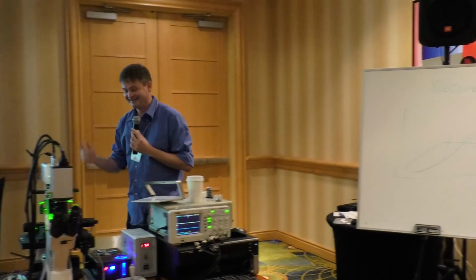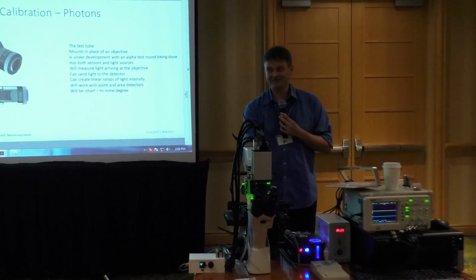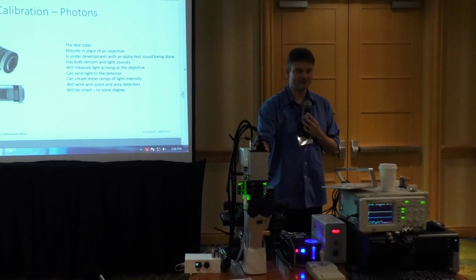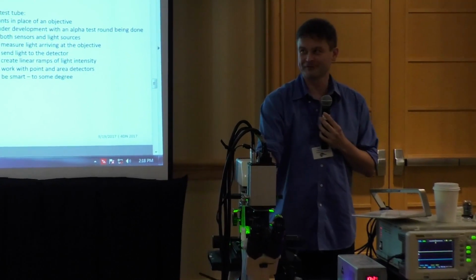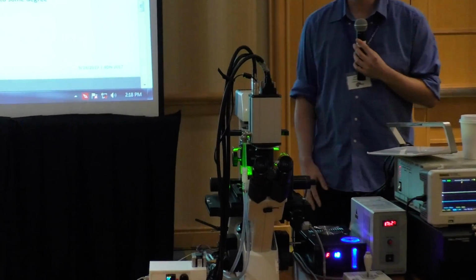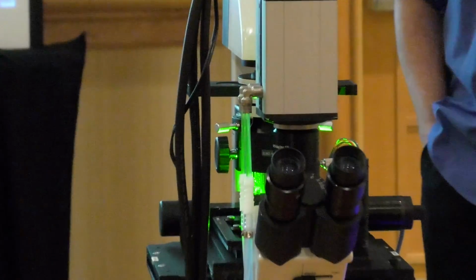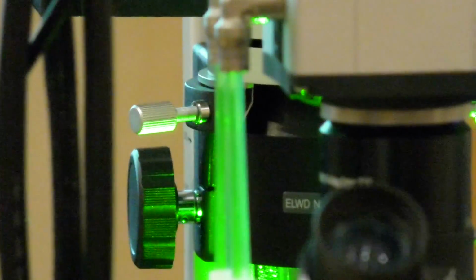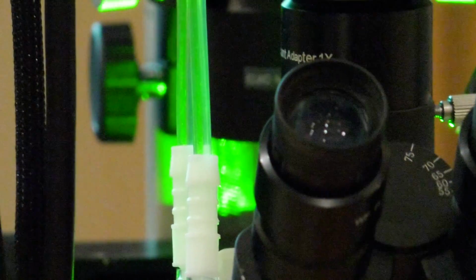Ha! Okay. Well, we talk about something that's in the back here. This is the most cheap and useless form of a fluorescent light source. This is standard, like mercury. And you want the total, what units are you talking about? What is the right unit? The question is.